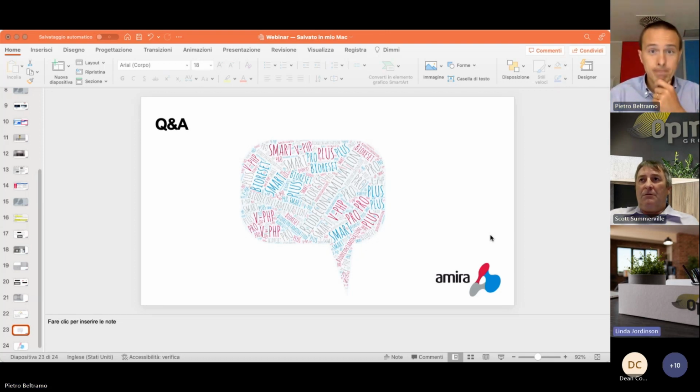Okay. So presumably the H2O2 will break down into H2O. What happens to the residual water droplets or vapor around the clean room? That's correct. The H2O2 will break down to water and oxygen, but it takes more time than you expect. So the aeration will not be done by waiting for the molecule to break down. It takes 48 hours, which is not feasible. You cannot wait 48 hours before entering your room or your isolator to start the production.